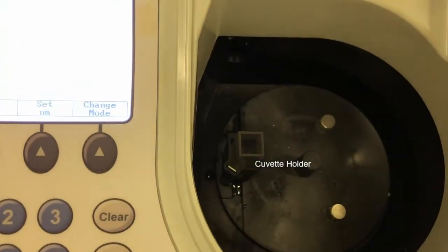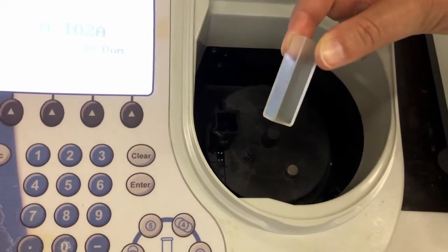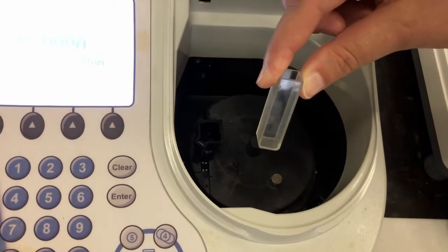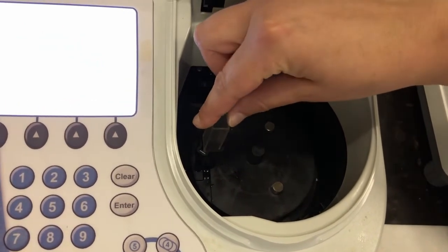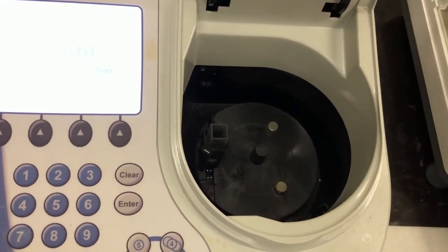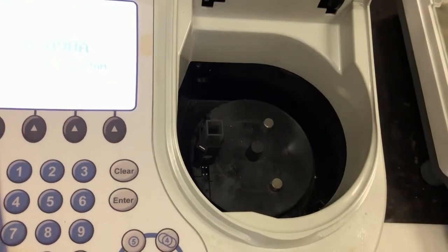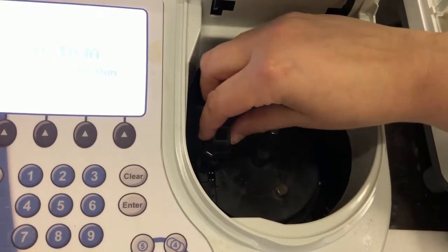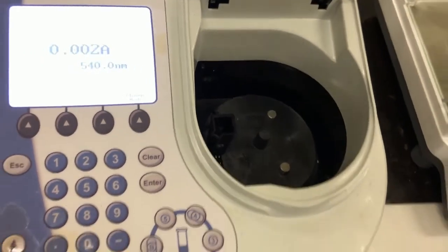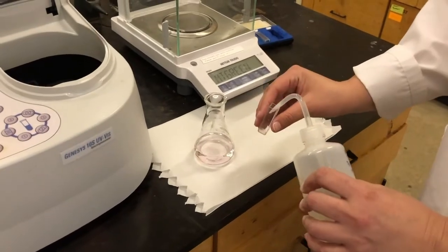It has to be oriented so that the glass sides, let's take that out again, you see that this cuvette has frosted sides and a clear glass side. So you want the light beam from the spectrophotometer to shine directly through those glass sides. In this spectrophotometer, the light beam goes vertically through, so you want to have the glass side facing in that direction. We're going to start by doing a blank. We're just going to use some distilled water in our cuvette.